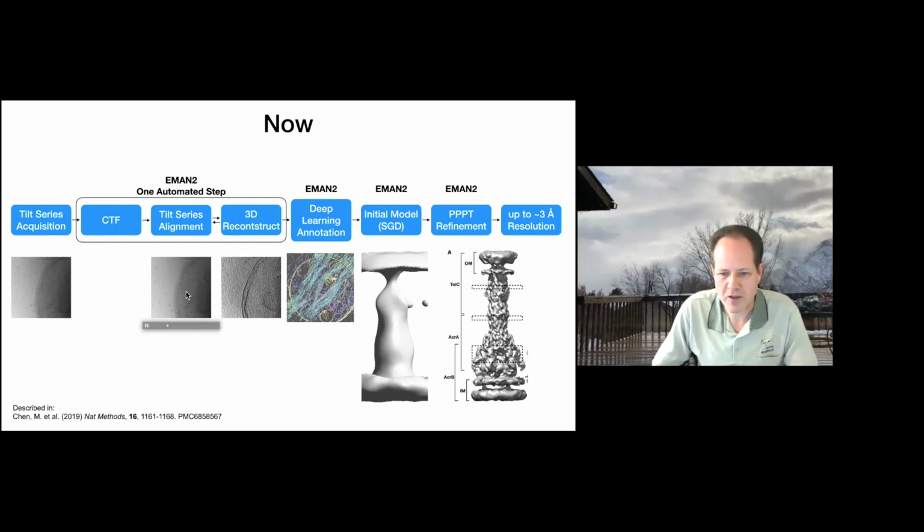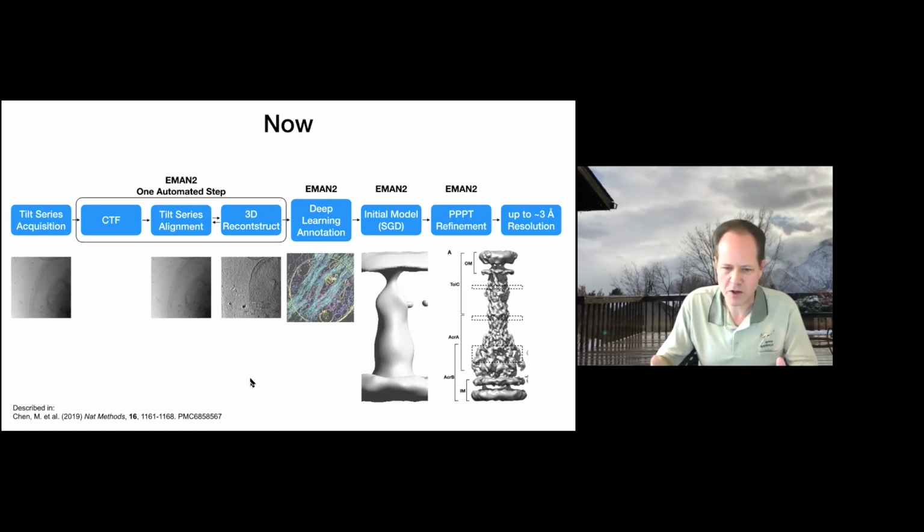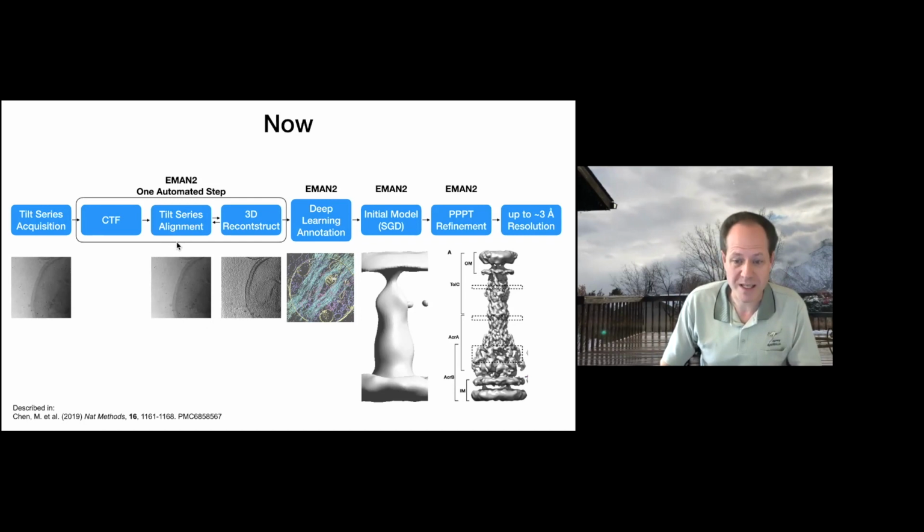I have fiducials in the little example that you see scrolling here, but it does not require fiducials. It pretty much works with any reasonably well-behaved tilt series, meaning that if halfway through the tilt series it shifts by 2/3 of the frame or something like that, then nothing is going to save you there, because you don't have sufficient data to really do a good tomographic reconstruction. But as long as the tilt series is reasonably complete data-wise, basically this will work. If you come up with an example case where it doesn't work, just using the default parameters automatically, we encourage you to send it to us, and then we'll try and sort out what's going wrong.